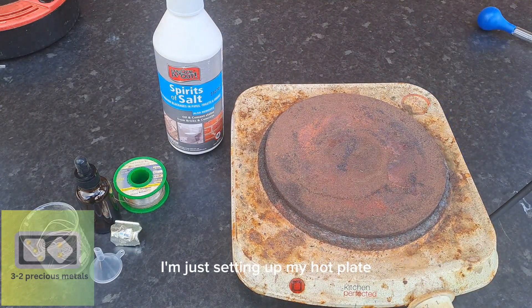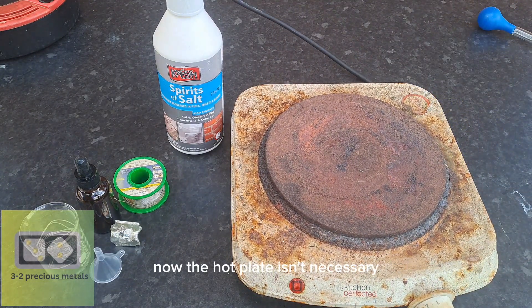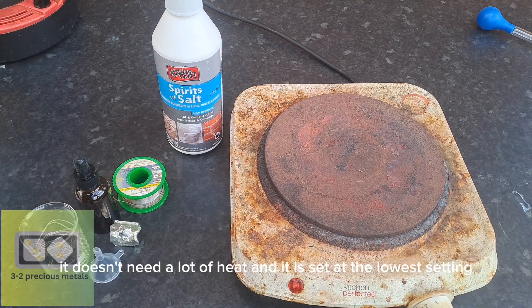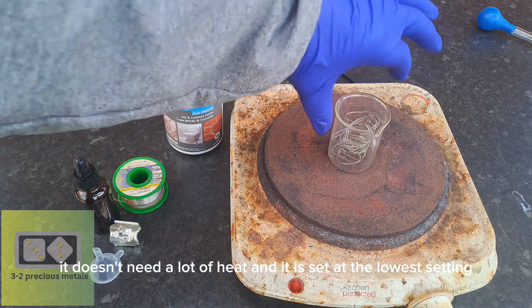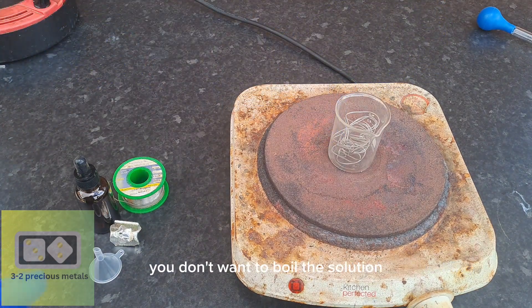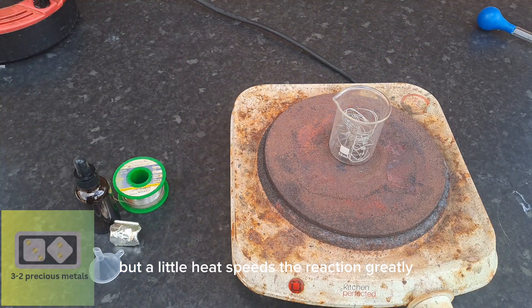I'm just setting up my hot plate now. The hot plate isn't necessary, but it does help the reaction. It doesn't need a lot of heat and is set at the lowest setting. You don't want to boil the solution, but a little heat speeds the reaction greatly.